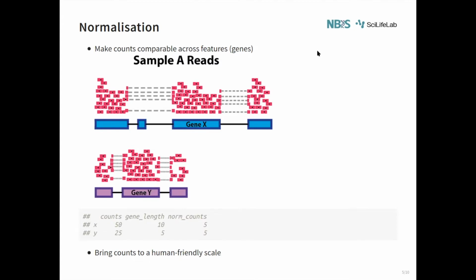Okay. But when you say gene length, do you mean the length of the spliced gene transcript or the total one? Yes, it's the processed one, the mRNA length or exonic length. Yeah, that's a good question. By gene length, it's actually transcript length. That is what really matters.